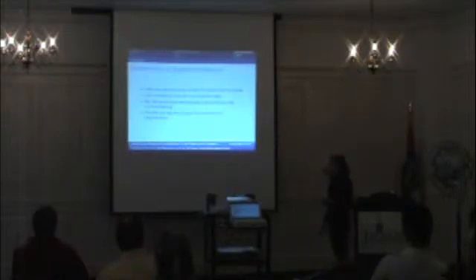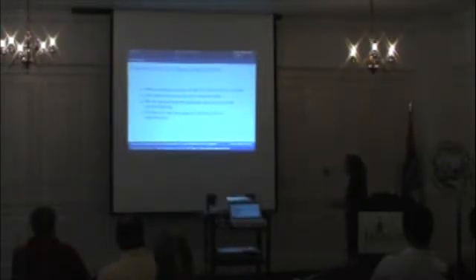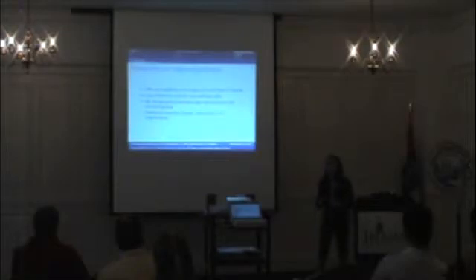Also, since we only are looking at the 4-cell stage right now, we don't have to worry about a lot of complexity. Even if we choose an algorithm that's kind of computer intensive, it's probably okay because there's not a lot to look for. Also, we're generating our own data sets this summer. We don't have existing data sets that we want to use. This means that we can pay a lot of attention to adjusting contrast and lighting measurements so that we can get the best image possible for the algorithm. Also, in most of the focal planes, except for the ones on top and the ones on bottom, you can usually see the nucleus. This is helpful for certain segmentation techniques, so we'll talk about that later on.